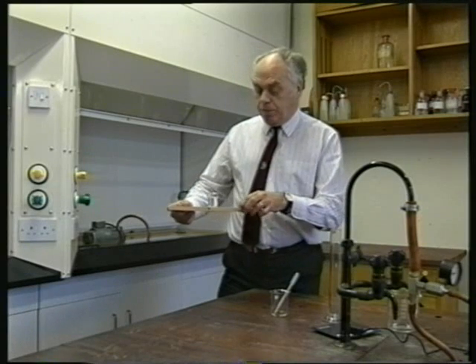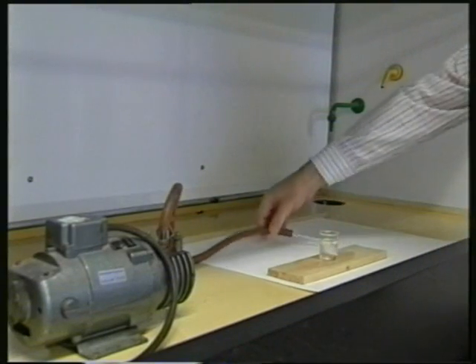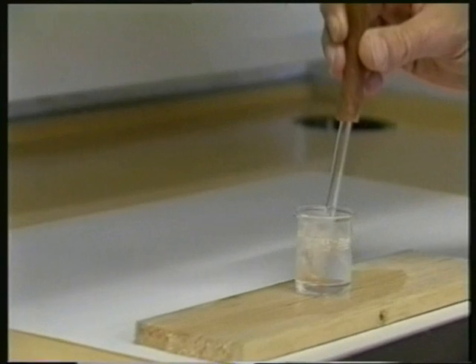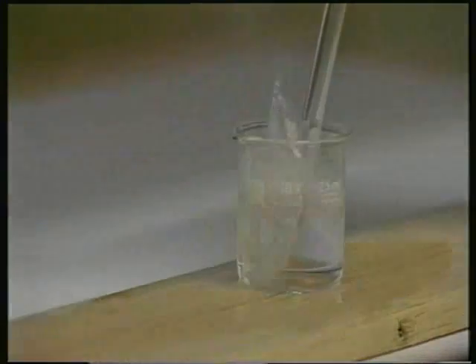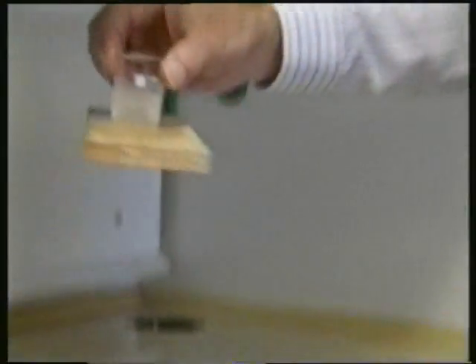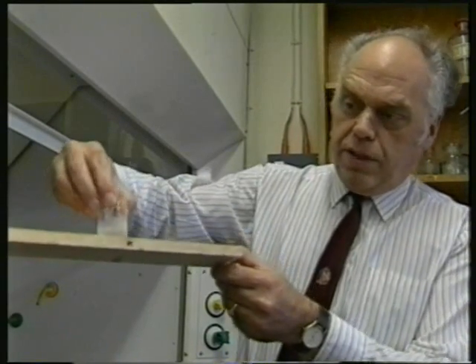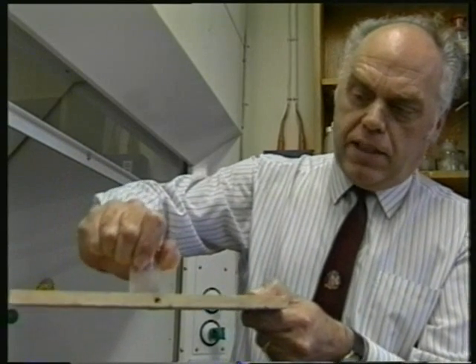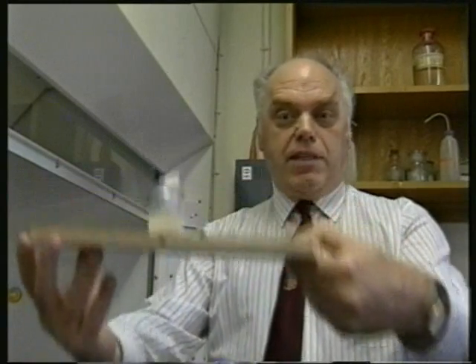The pump's rather noisy, but it'll only stop me speaking for a little while. You can see that the beaker is in the fume cupboard, and it's stuck to the piece of wood. Actually, it's frozen to it, and you can see the frost that's formed on the outside of the beaker as well. I'm not sure that I can get that off at all yet. We'll have to wait until it warms up. Anyway, it's quite impressive, isn't it?